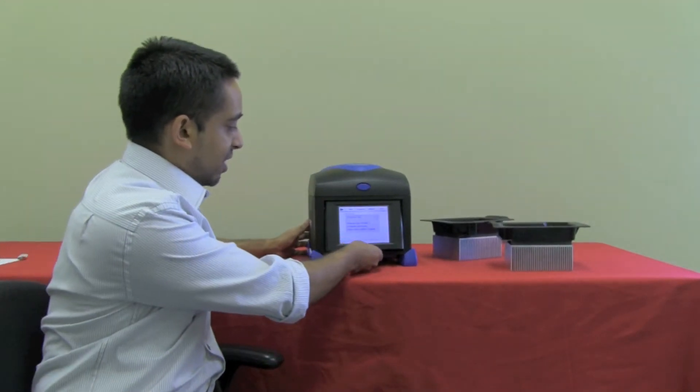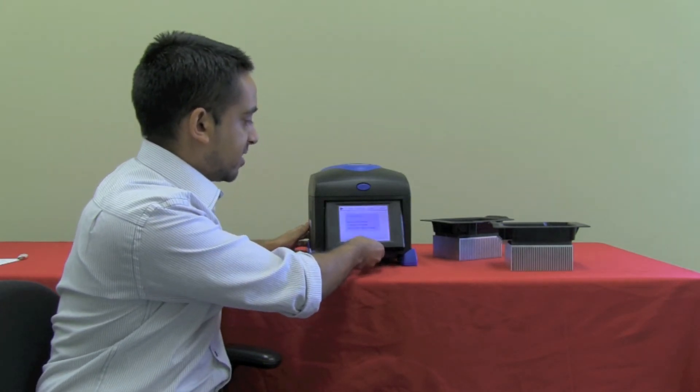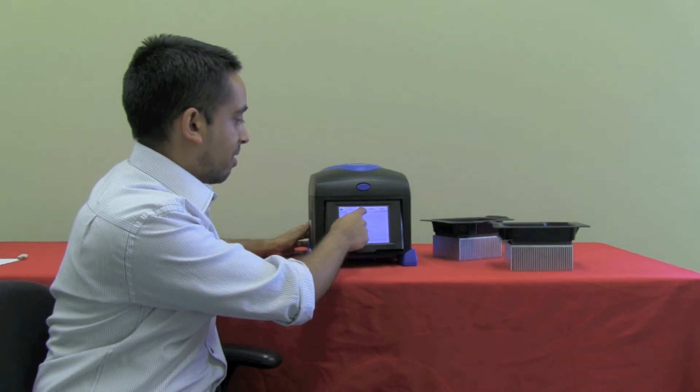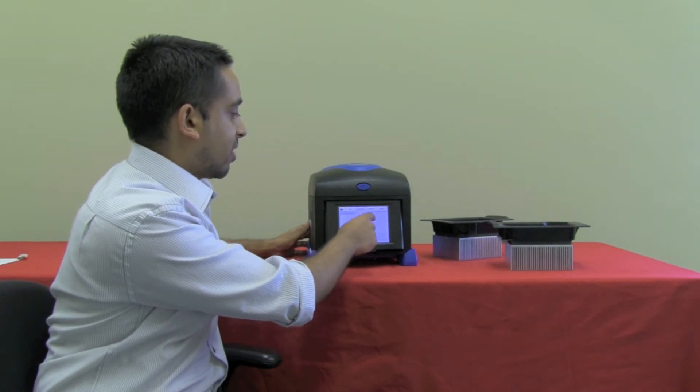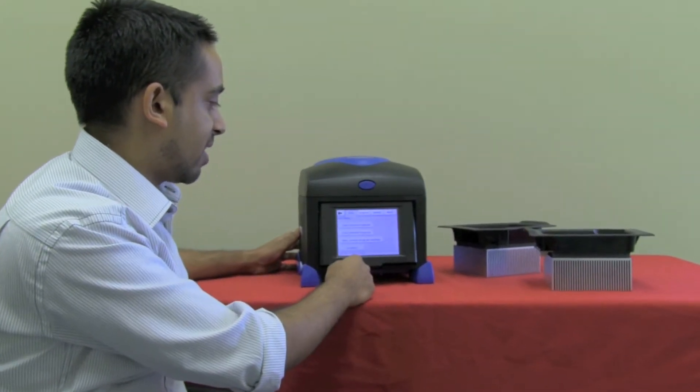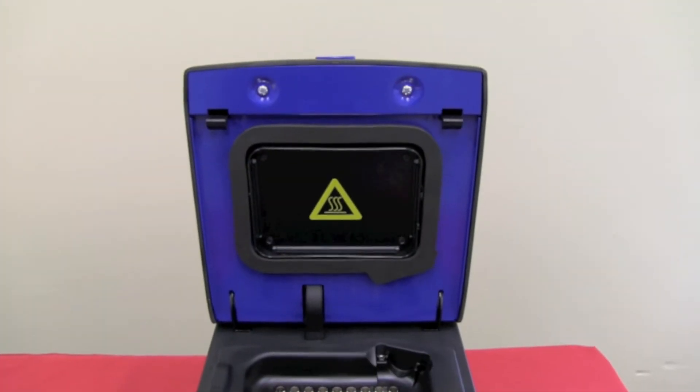If we take a look at some of the features, we can look at this touch screen display here. This is adjustable and from here we can take a look at all our parameters at any given time. We can look at our gradients, our temperatures, and we can also change parameters and program parameters here as well. Another unique feature of the Series 6 is its lid locking mechanism.